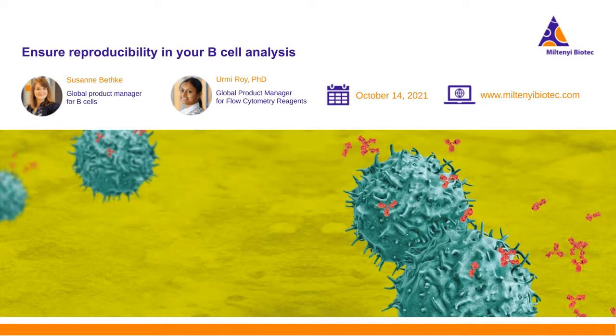So yes, another question for me. The antigen-specific B cells, as I said, are really rare cells, so it's a bit tricky. You can do that in several ways. As I mentioned here, you can do it with the cell sorter.